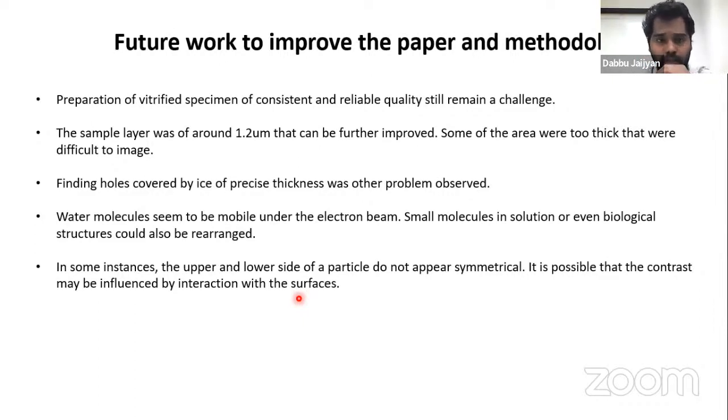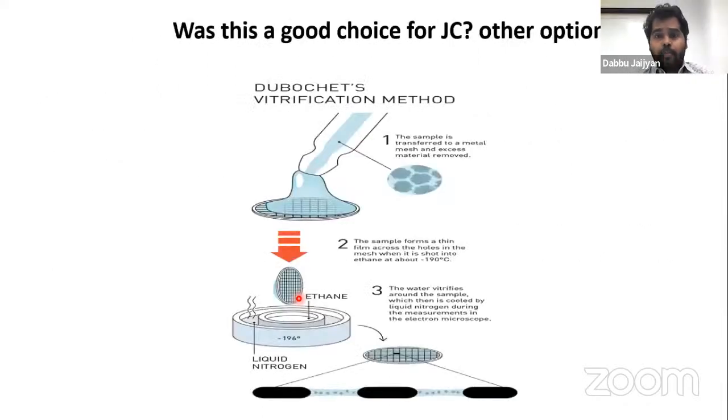So these are some flaws in the paper, but still I would suggest this was a very good paper, showing how this method was developed and what the basic principles behind it are. Again, I would like to emphasize that each and every step remains the same as what we do today, but we do it using a Vitrobot, or automated robotic machines that do all these steps. The fundamental principle and basic concept remain the same as in the method developed about 25 years ago.